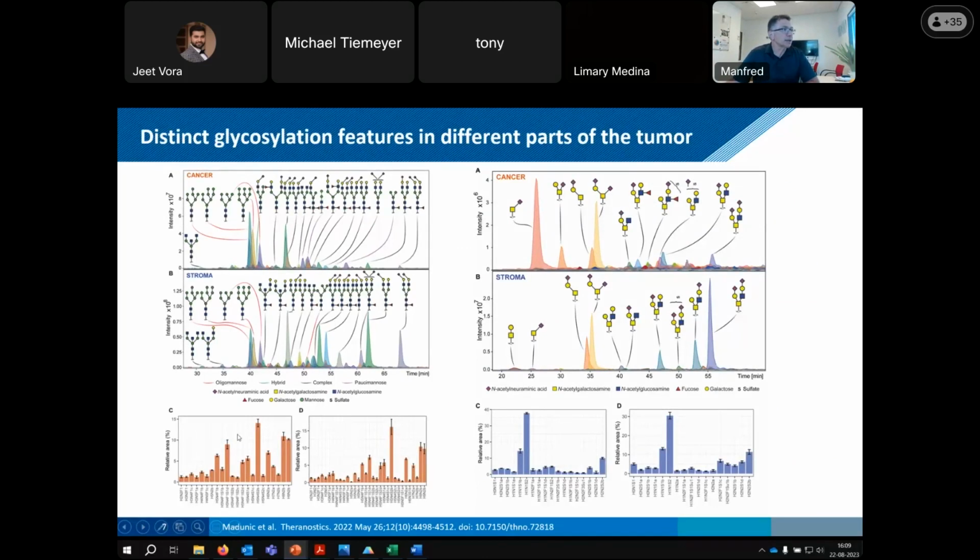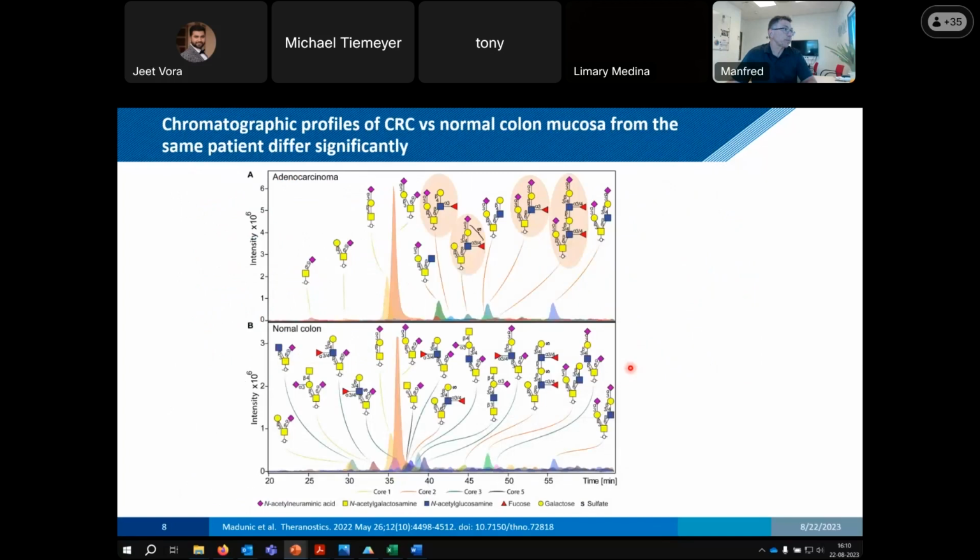And we can measure these glycomic signatures for the N-Glycans, but also, I will try to use a laser pointer, but also for the O-Glycans as shown at the right-hand side in a repeatable manner. And that's important, of course. And we see that indeed the glycomic signatures are very different for these different areas, which are maybe just 100 micrometers apart, but dictated by very different glycosyltransferases and glycomic signatures.